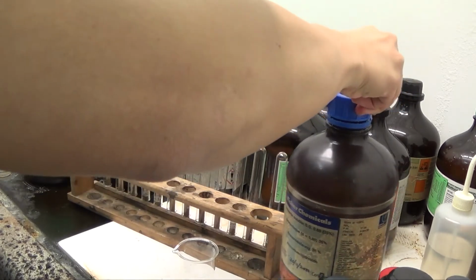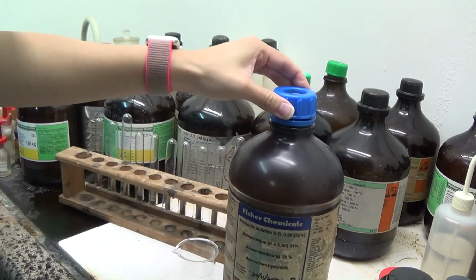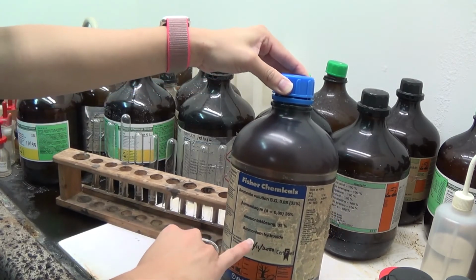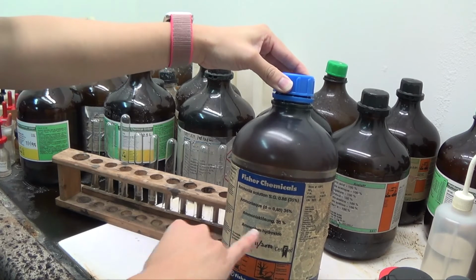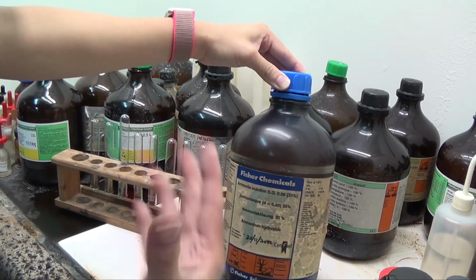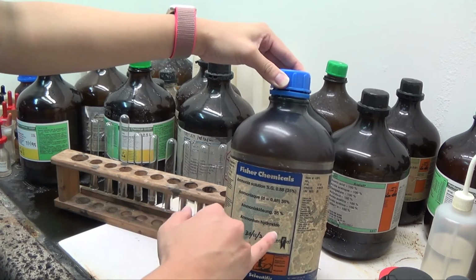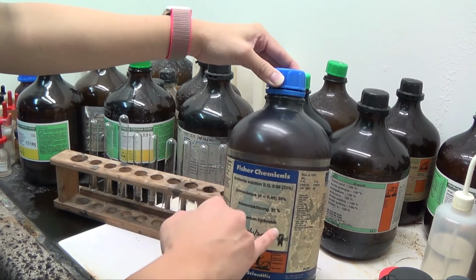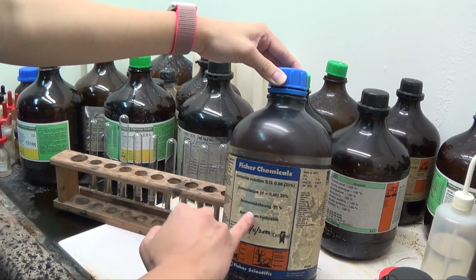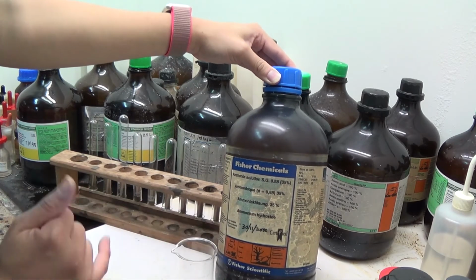So I've got an ammonia solution. This is concentrated ammonia, ammonium hydroxide, because you have ammonia dissolved in water. Ammonia is a gas at room temperature and pressure. When you dissolve it in water, you get ammonia plus water giving you ammonium hydroxide. So it's a base. It's a weak base because it reversibly ionizes, or partially dissociates, into the hydroxide ion.